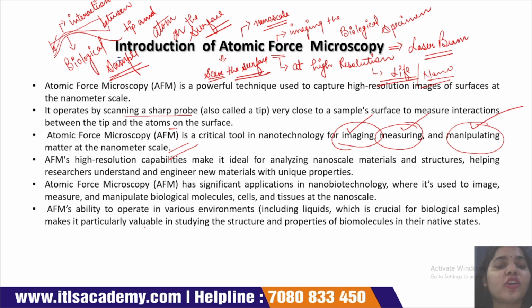Atomic force microscopy has significant applications in nanobiotechnology. It is used to image, measure and manipulate biological molecules, cells and tissues at the nanoscale.